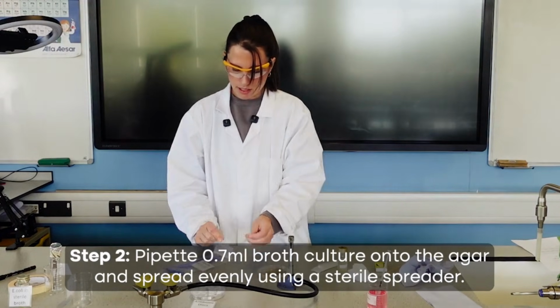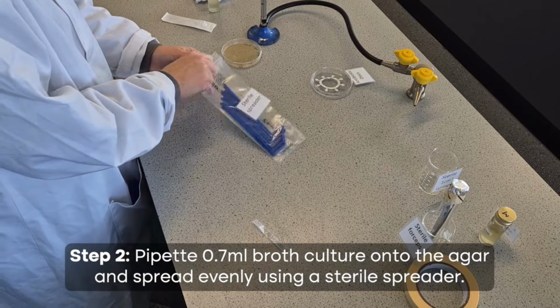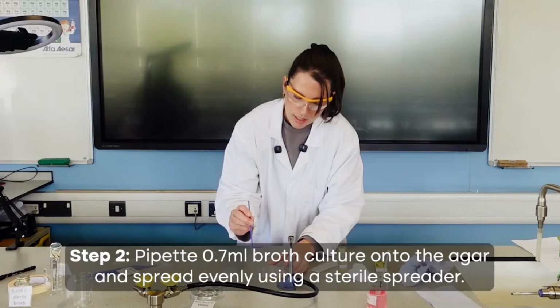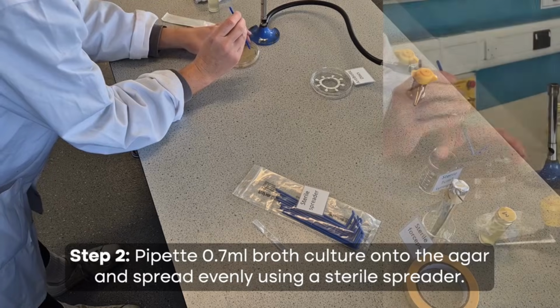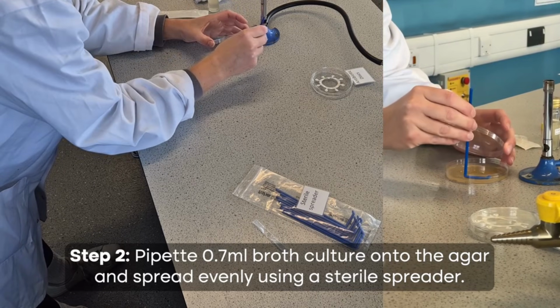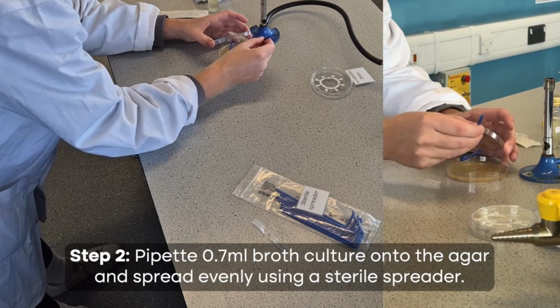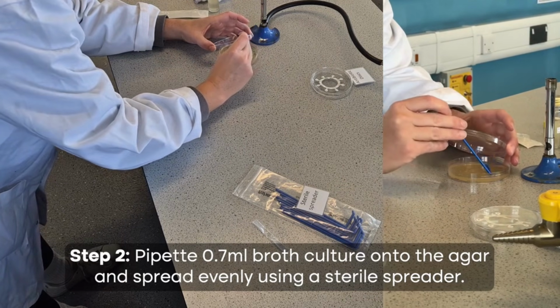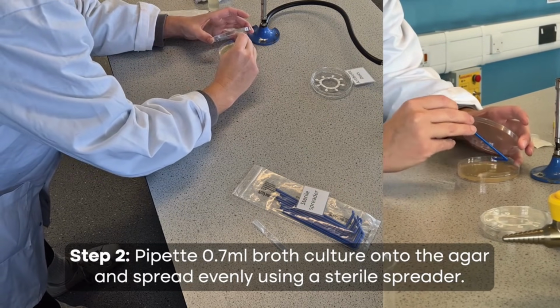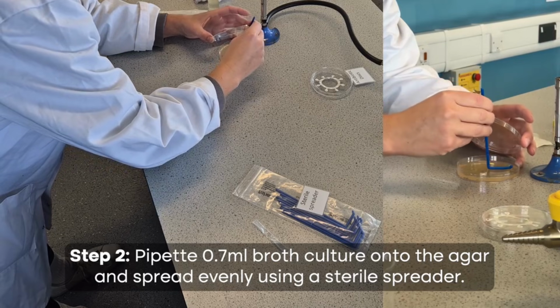Next, I need to open these spreaders. We can see it was a sealed sterile pack, so as soon as this is opened, they're no longer going to remain definitely sterile. So again, you want to only slightly open the lid, and you want to be working near your Bunsen burner. You need to make sure you're spreading it all over the plate. And it's hard for students to do this because it is all colourless, so you can't actually see for definite, and you'd want to try and not add in microbes.